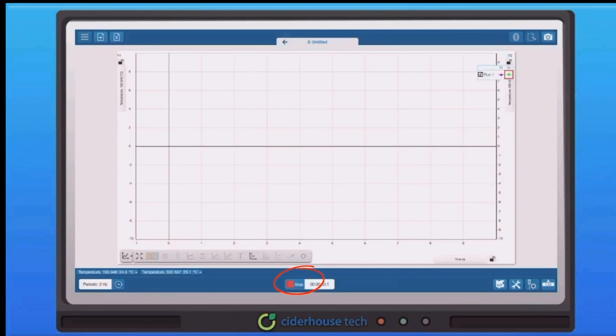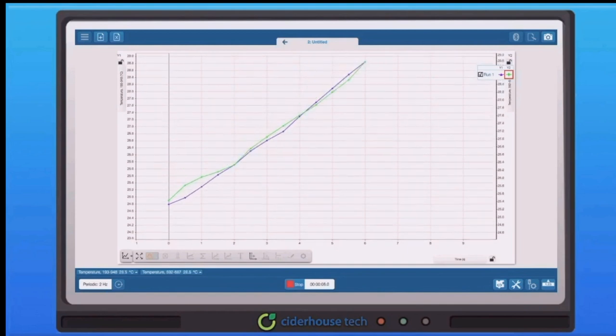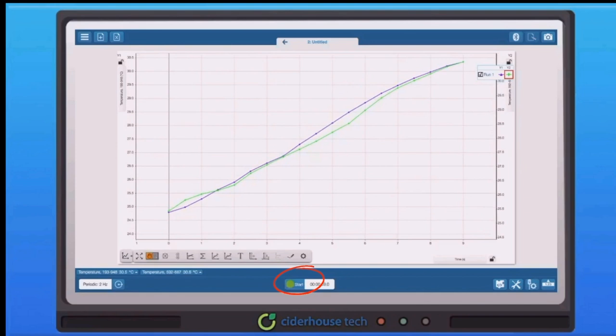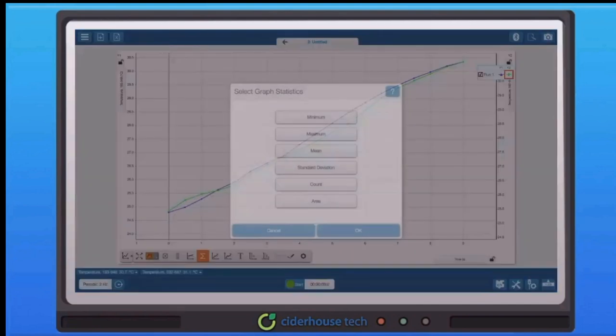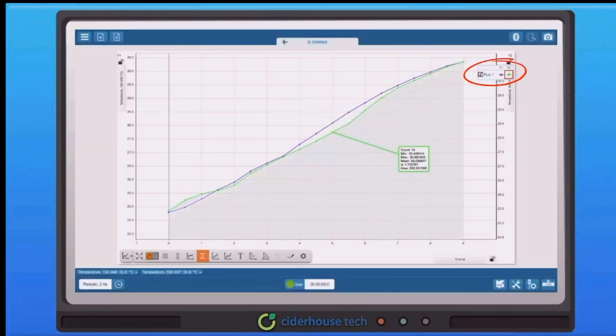Now, press Start to collect data. Once we have pressed stop, we can begin to analyze the data collected from both sensors. To change the sensor for analysis, choose the color of the run in the run box.